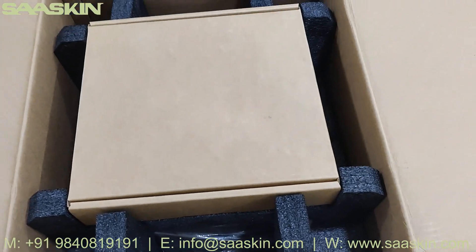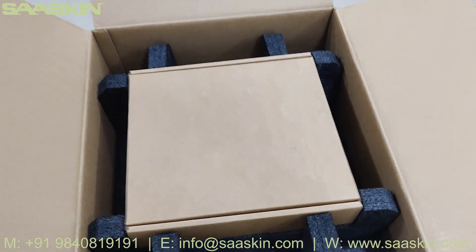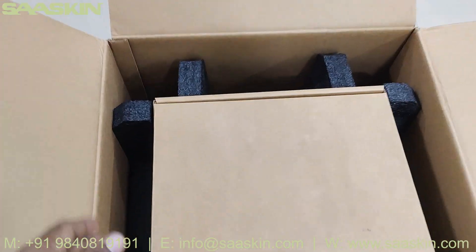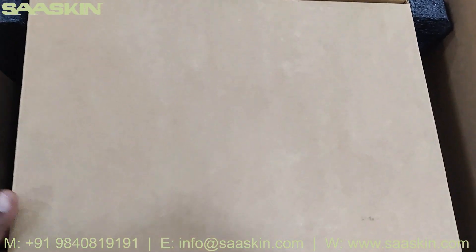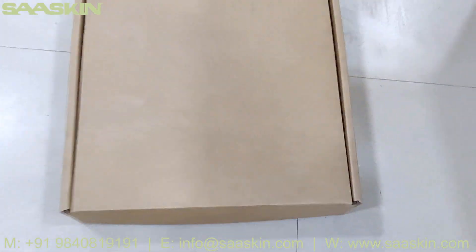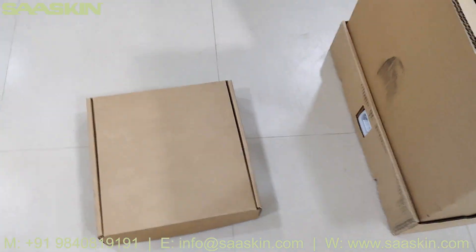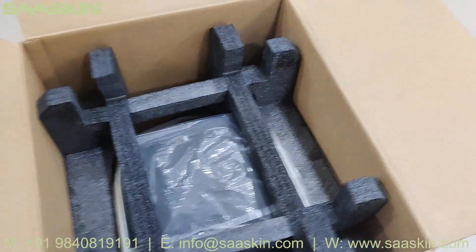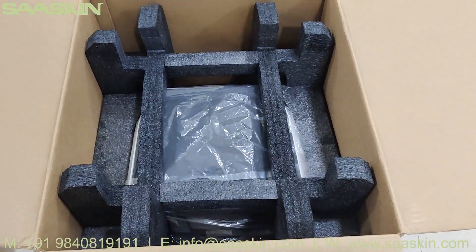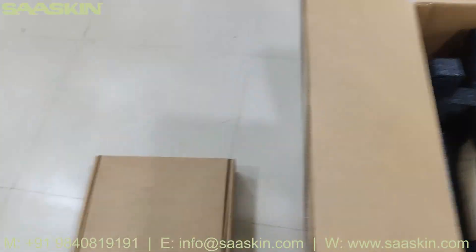You can see inside the box — this is how the inside looks like. In the top you can see there is one cotton box. I am just going to open this for you. You can see the cotton box and inside you can see how it looks. All the accessories are stored inside the cotton box.